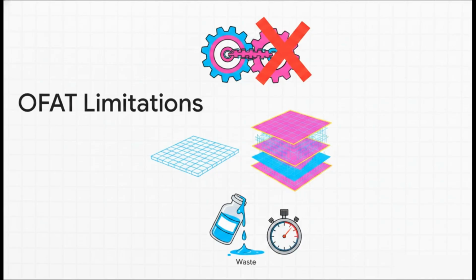For instance, maybe a high concentration of capture antibody actually requires a much more stringent wash step to prevent a high background signal. You wouldn't see that on a classic checkerboard. Plus, this method is highly resource-intensive and time-consuming. Because if your first checkerboard doesn't give you a good signal-to-noise ratio, well, you have to start all over with a brand new range of concentrations, wasting precious, expensive reagents and completely derailing your timeline.